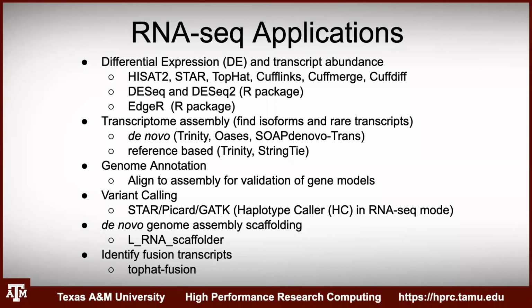STAR is really good as well. I prefer HiSat2. It requires less memory and it appears to run faster. And I had better mapping results with HiSat2 than I have with STAR, but STAR is really good. Some packages for actually dealing with or looking at differential expression, DESeq2 and edgeR, both are fine.